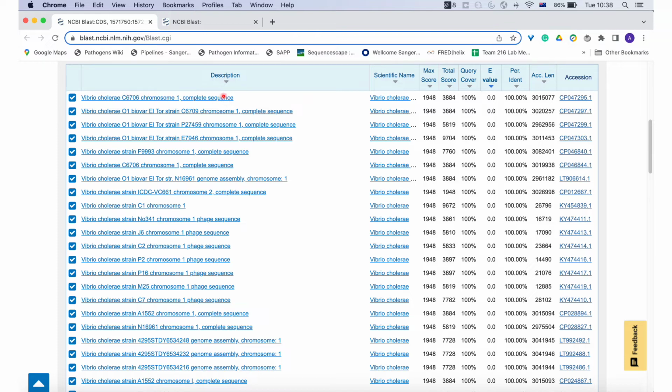That said, we're not actually getting a whole lot of information from this, because one of the downsides of many genomes currently being available, and this just always increasing, is that if you are searching for something that's reasonably well studied, you're not going to get a gene ID necessarily from a nucleotide BLAST. And that's one of the reasons that we'll run a protein BLAST in addition. So we do get some phage sequence hits, so we are getting a bit closer, but in this particular instance where we want to modify the annotation, we want to actually know what gene it might be.